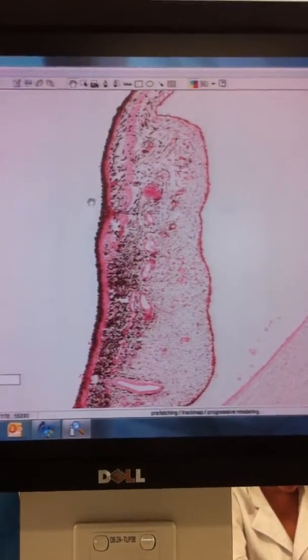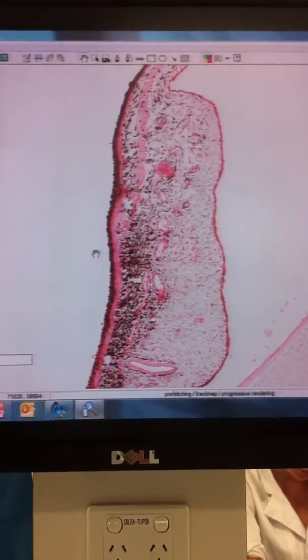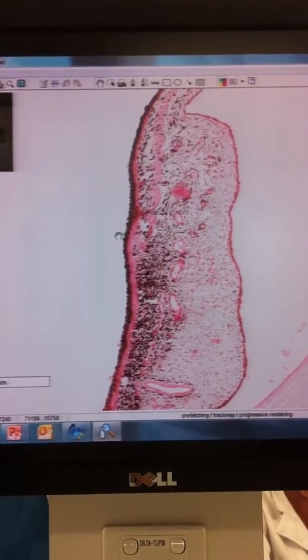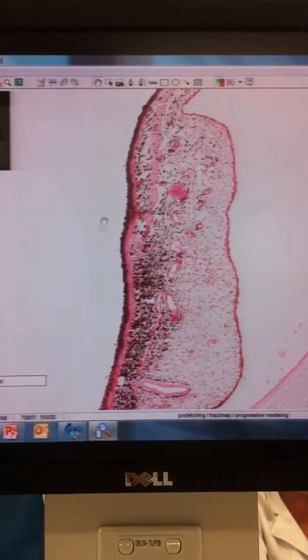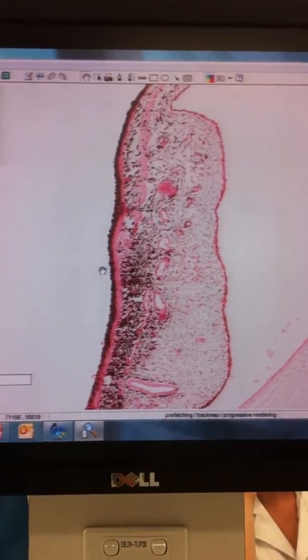On the back end of this, inside the eye here, this dark line here is obviously pigment cells, melanocytes, because they're absorbing stray light. Light hitting the back of the iris is doing no good for vision. It's only complicating vision, so it absorbs it. So it's this pigment layer on the back end of the iris which contributes to the iris colour, but also to absorbing stray light.